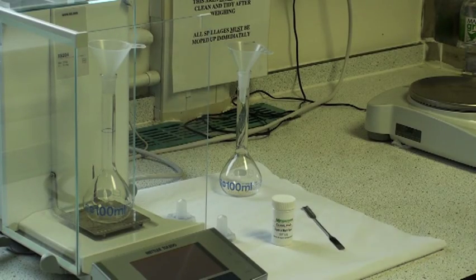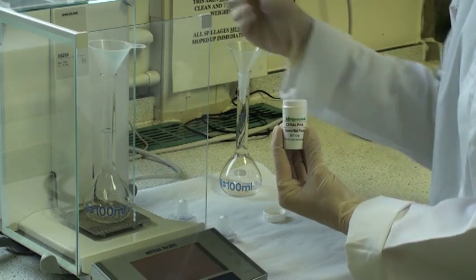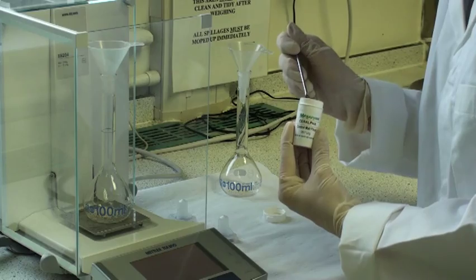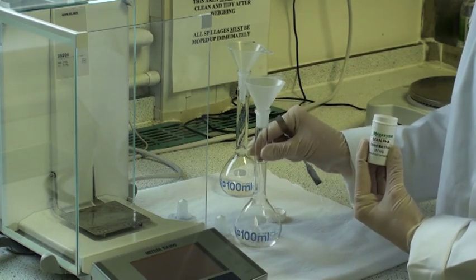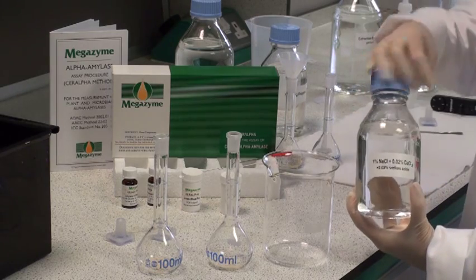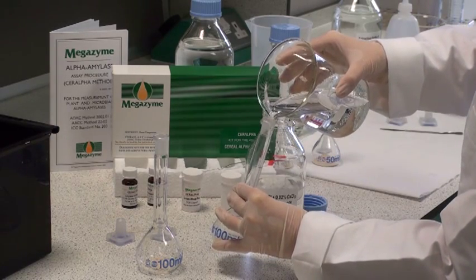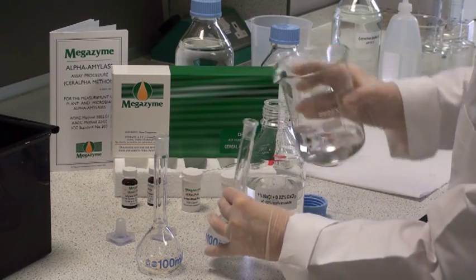To prepare malt extracts, first accurately weigh 0.5g of malt flour into a 100ml volumetric flask. Then remove the flask from the balance and tap it a few times to ensure that all the flour is transferred from the funnel into the flask. Malt flours are extracted with sodium chloride calcium chloride extraction solution, which is poured into the volumetric flask and made up to volume using a Pasteur pipette.